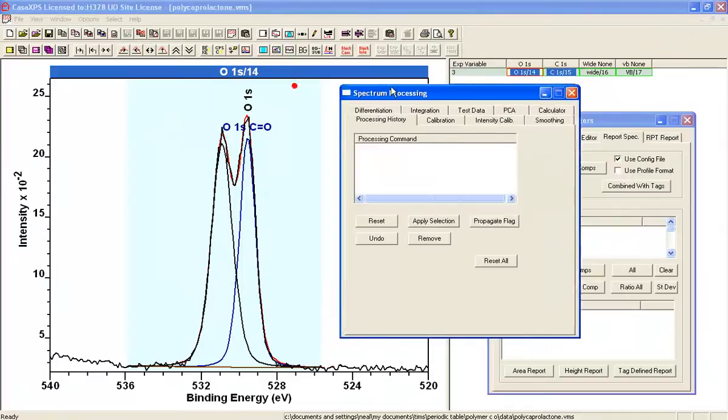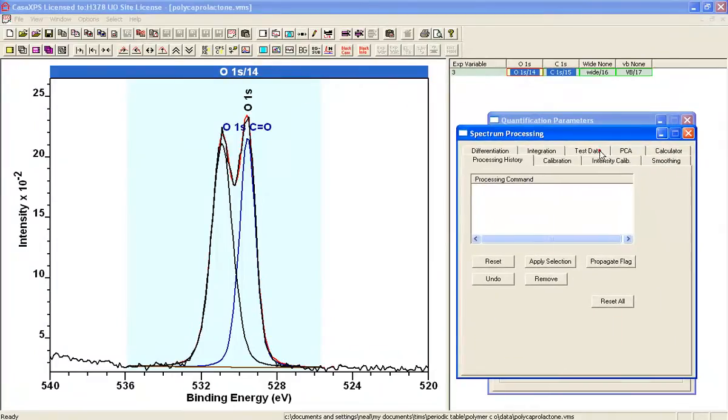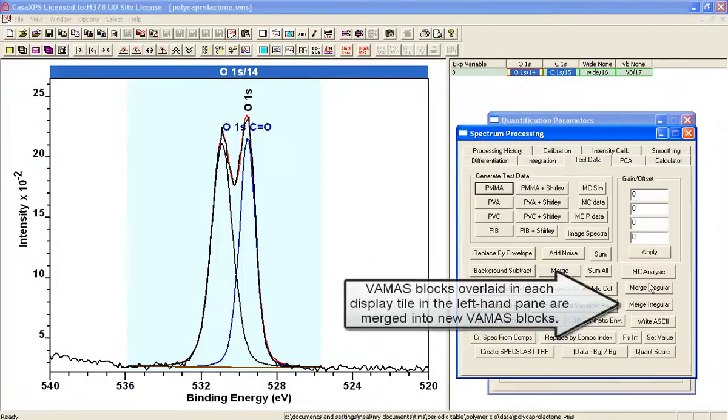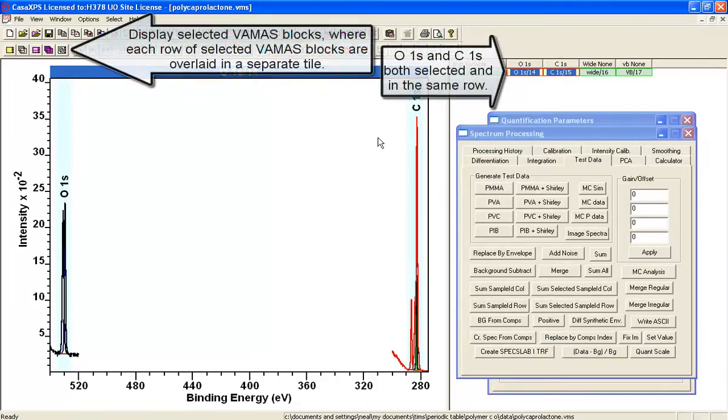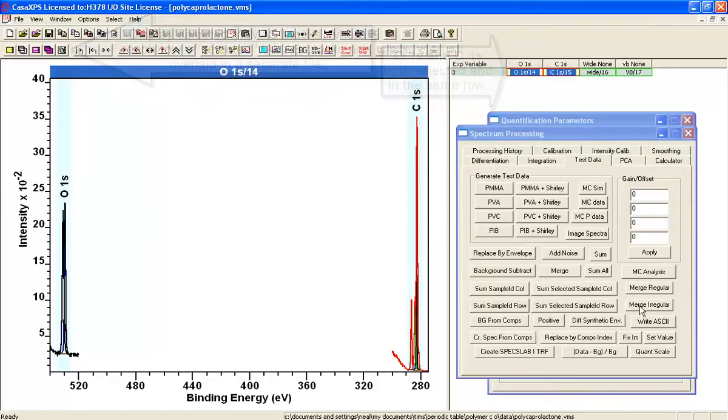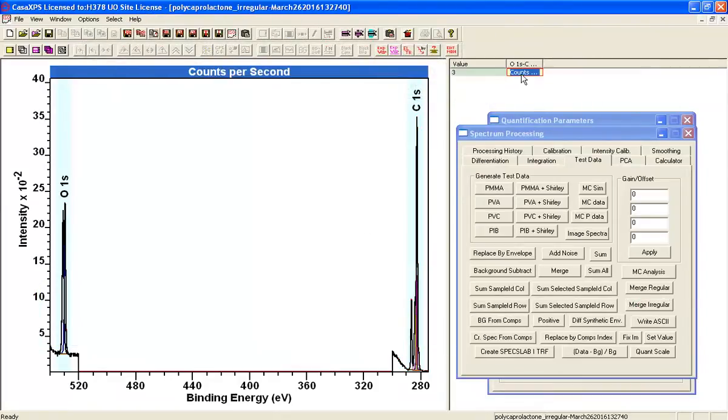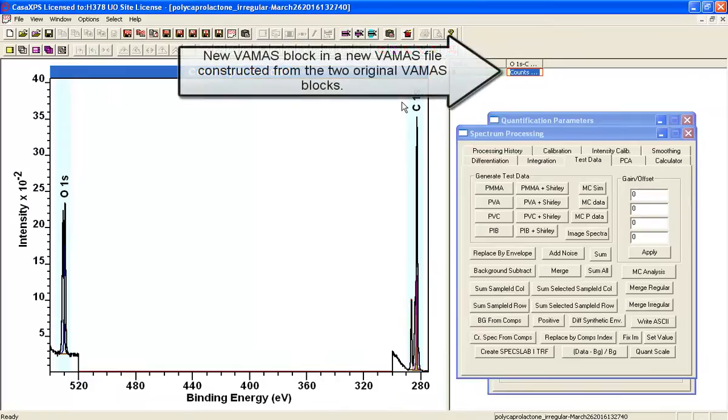I'll do that by bringing up the spectrum processing, the test data tab, and I'm going to merge irregular. What I have to do is first of all display in a single tile the oxygen and the carbon for which I want to create a new VAMAS file. I want to merge them so I have a single VAMAS block that contains the spectra for both of these.